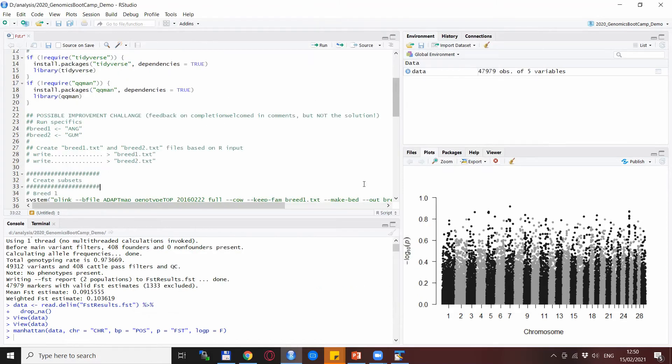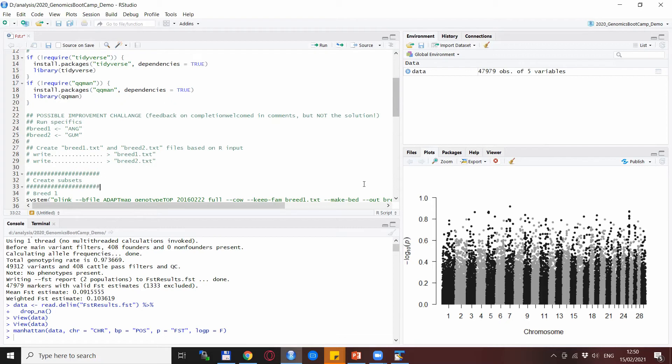Now back here for this first part and this small challenge I mentioned to you. Basically, this script could be improved because right now if you want to try out some different breeds, what you need to do is go to the breed1 and breed2.txt and rewrite those ones, save those files, and rerun this whole script.